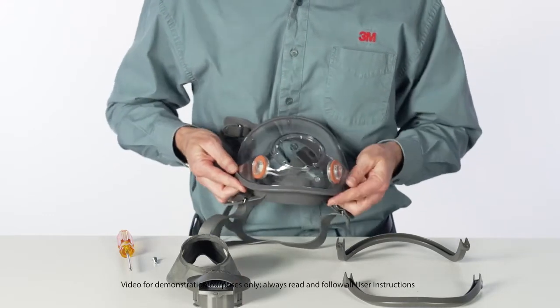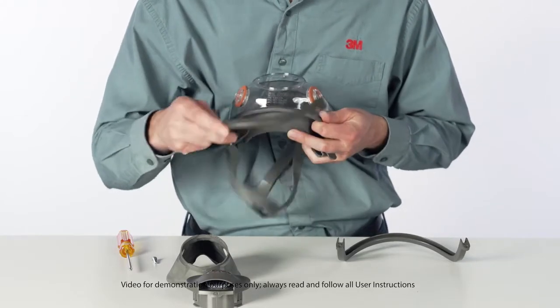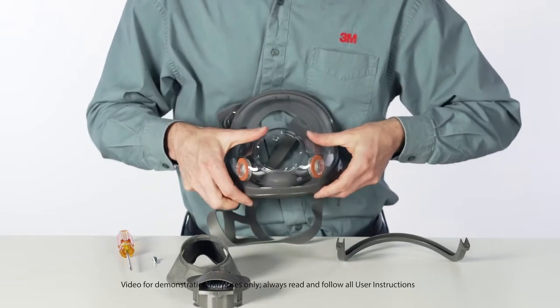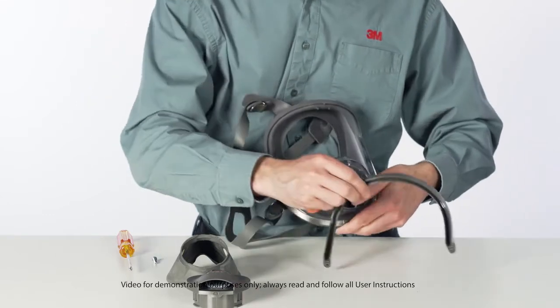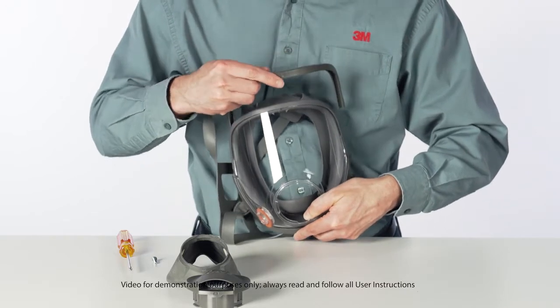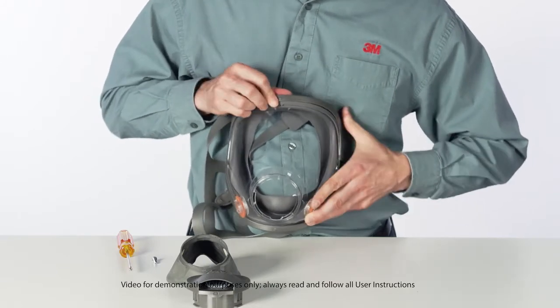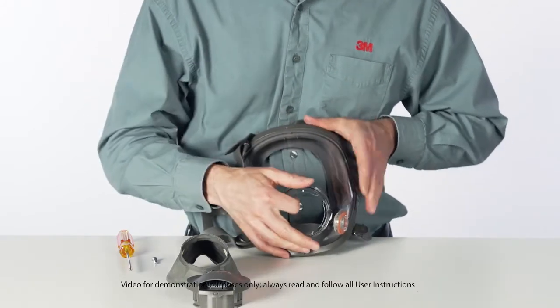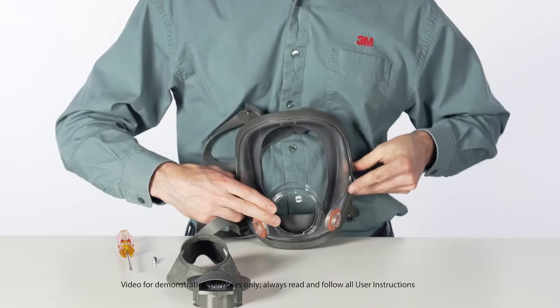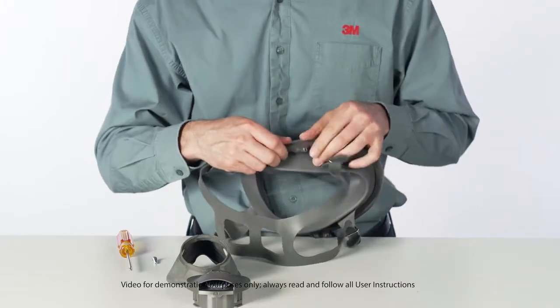Position the top and bottom frame, aligning the marks at top and bottom. Install and securely tighten screws.